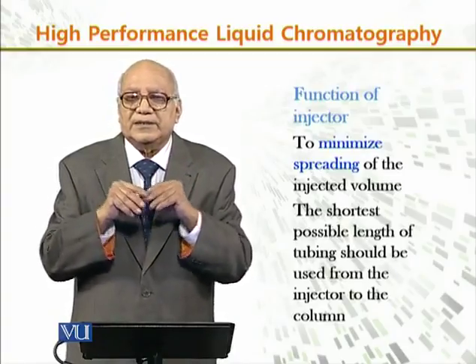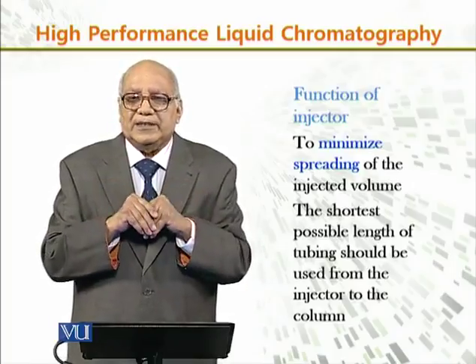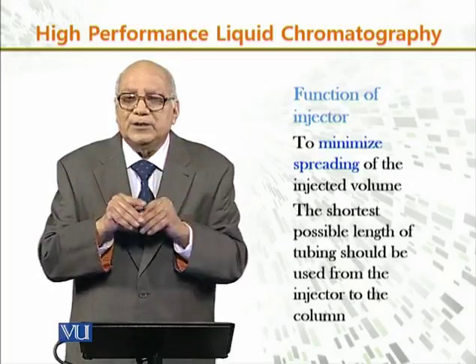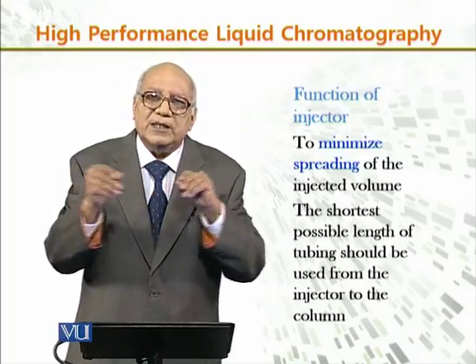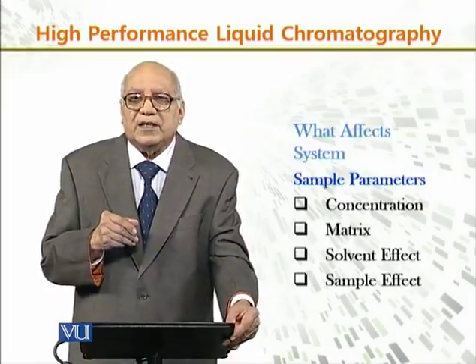These are the functions. The shortest possible length of tubing should be used from the injector to the column. This should be the shortest.